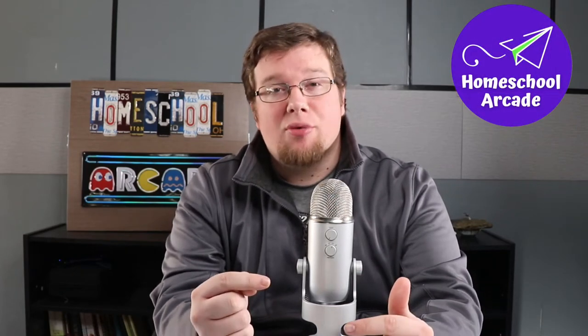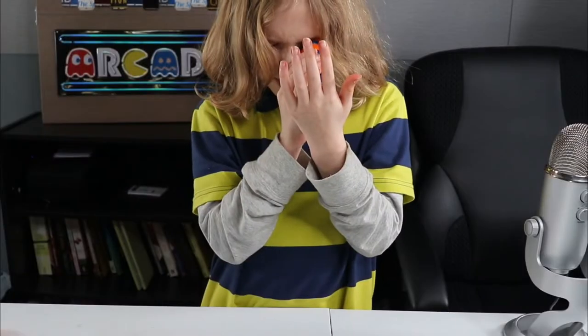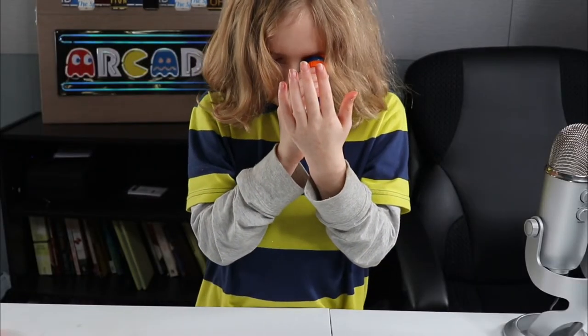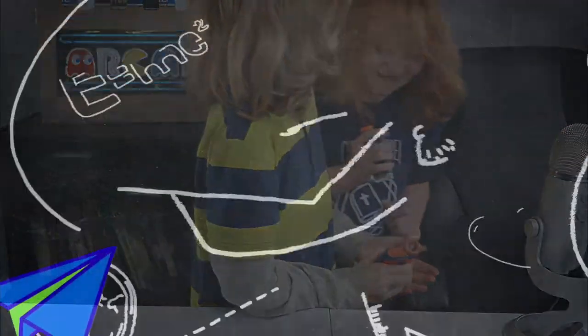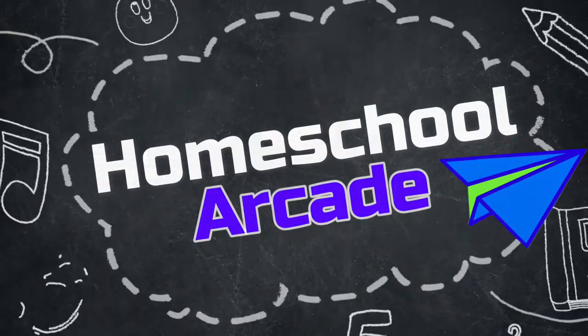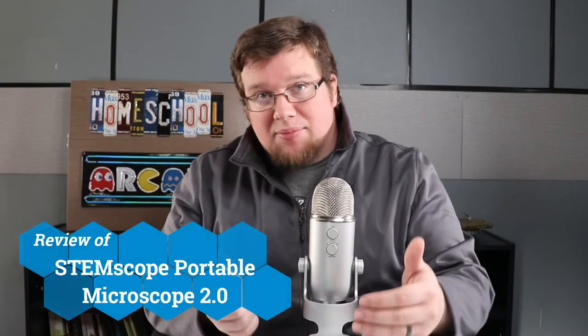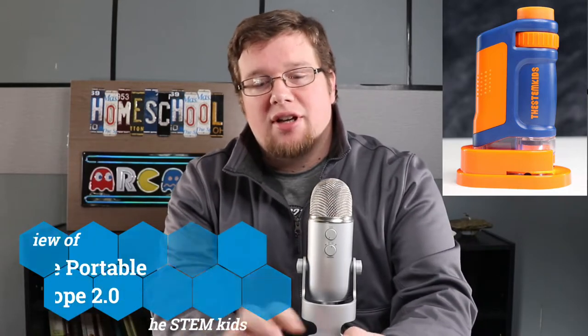Hey everyone, this is Homeschool Arcade and today we're going to be doing a review of a microscope product. What we're going to be looking at today is the STEM Scope — the portable microscope brought to you by STEM Kids, the 2.0 edition. Let me give you a quick look at it.